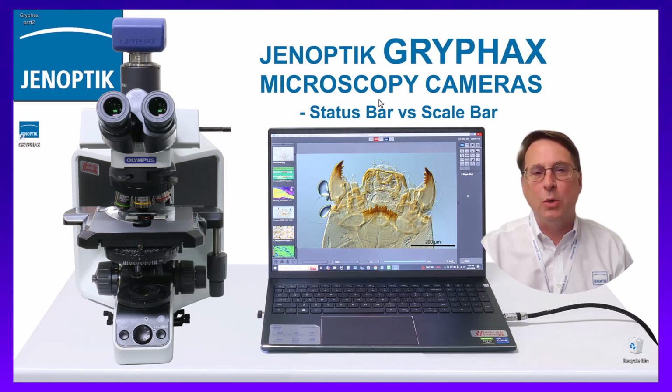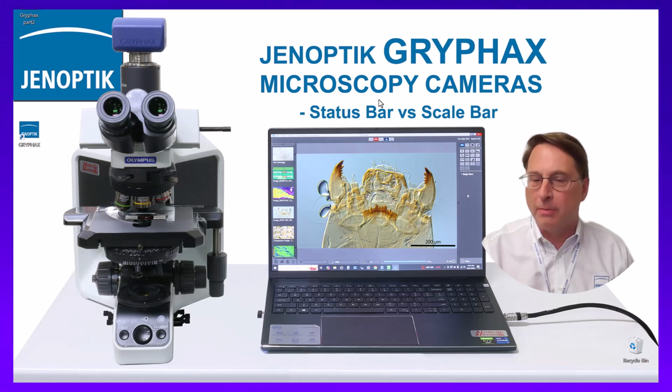In this video, I'm going to go over the difference between the status bar versus scale bar options within the Gryphax software that comes with Gryphax microscope cameras from Jenoptik, Germany. I'm Bob Martin. Let's take a look at it.